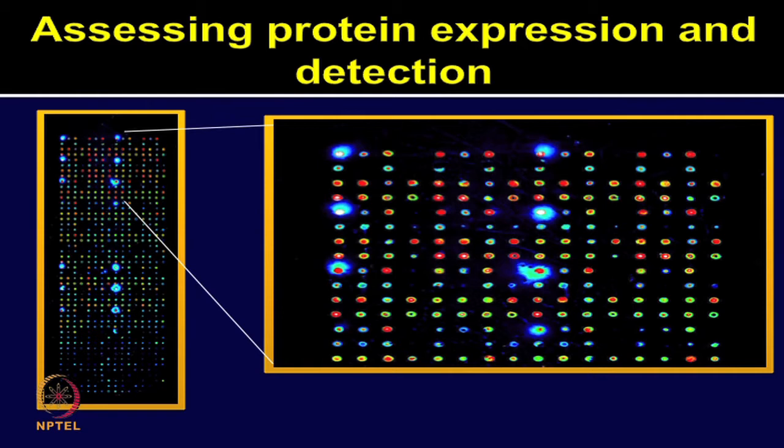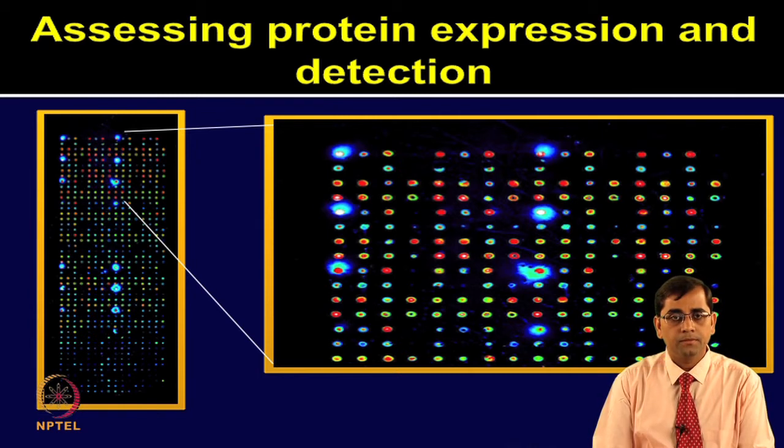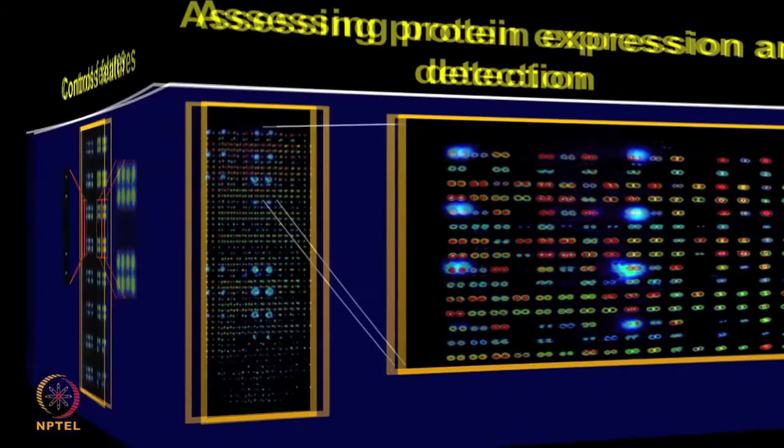If you are looking for different types of immunological response in biomarker discovery, etc., you need to ensure that immunoglobulin IgG is printed at varying concentrations. It can also be used for statistical analysis run by the biostatistician, so that different types of protein expression can be normalized.